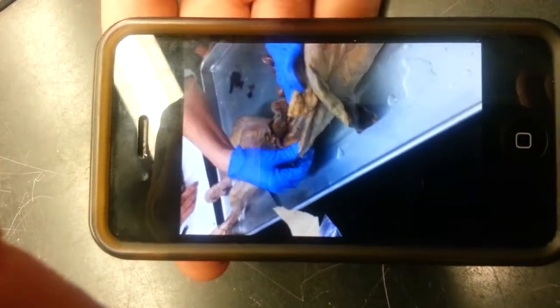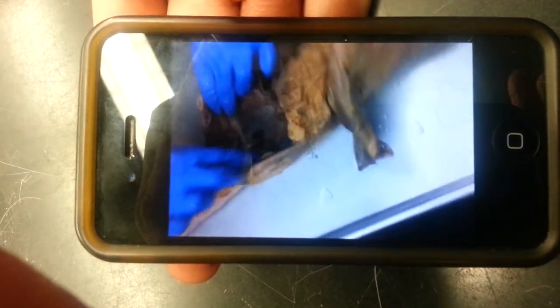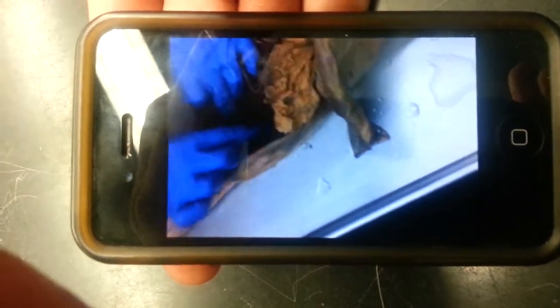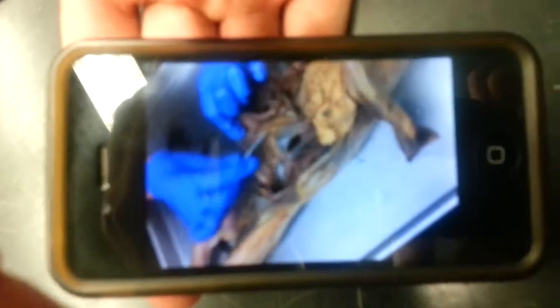Here's the kidney. You guys haven't poked through that yet, but there's the kidney. If you eventually poke through this and pull it away, when you start getting down into there, you will strike the aorta, and you will strike the inferior vena cava. So you kind of got it. Right here is probably the inferior mesenteric, which is then going to split into the colic artery, and then you see all these tiny arteries coming off.